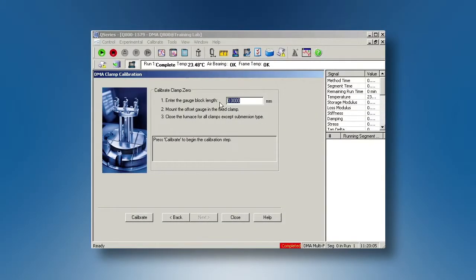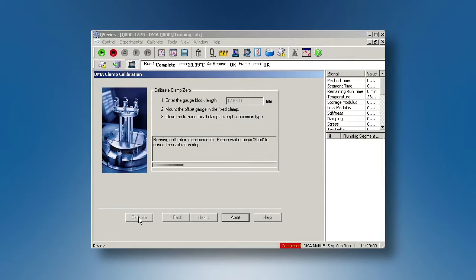From the control software, enter the length of the zero offset gauge. Then, click on calibrate.